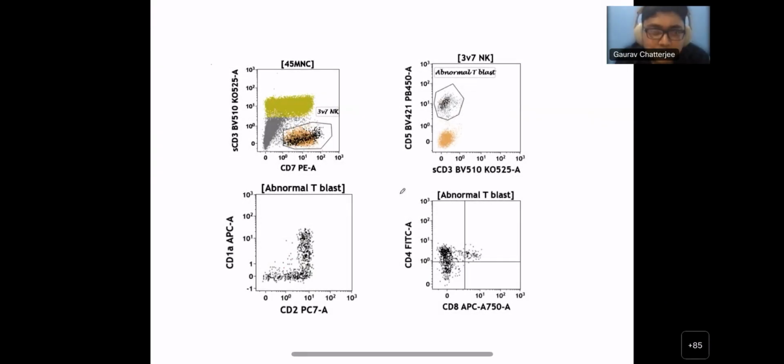So now let's go to T cells. Who can take this? Butts, can you take this? What are these yellow cells you are seeing, Butts? Just describe them and tell me what you think these cells are.